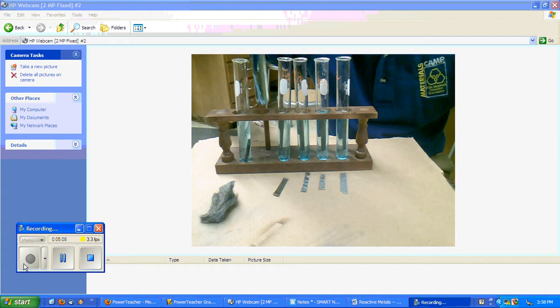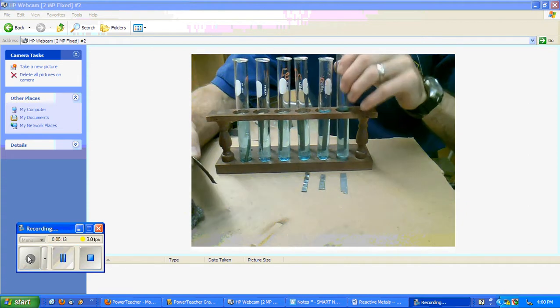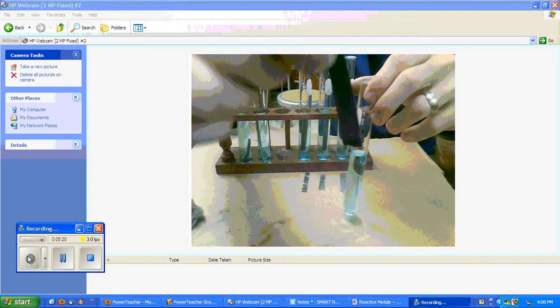Okay, that's aluminum. Yay, aluminum. Alright, now we have iron. It doesn't start off as shiny as the others. It's kind of glossy a little bit, but it keeps some of its dark color.